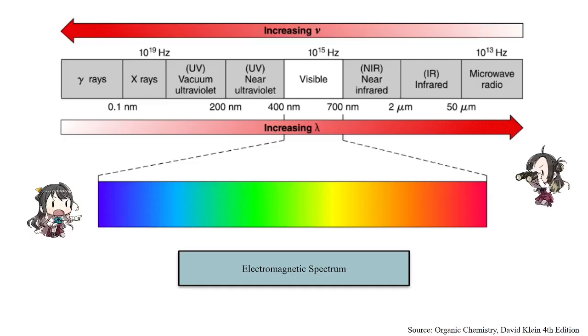If you're in L-Chem, particularly in Chem 12B, you're going to utilize a piece of equipment called the NMR machine, which uses radio waves to help you determine the arrangements of hydrogen and carbon atoms. And for a lot of chemical analysis, we use a piece of equipment called an IR spectrometer, which uses IR radiation to help us determine the functional groups within a sample that we're looking at.